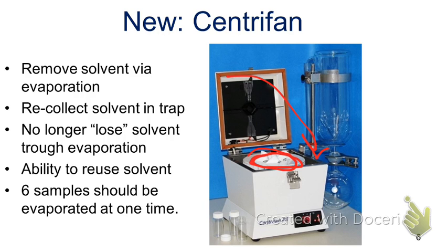Okay? The other thing that it does while spinning is it's got propellers in it that causes a fan action. So it's actually going to be blowing air out the back end. So as the solvent evaporates, it blows that now solvent-rich air out the back of the instrument. So if you look at the instrument, you'll find 2 little attachments or hoses in the back. One of those hoses, which is the output, goes over to this glass thing on the side.